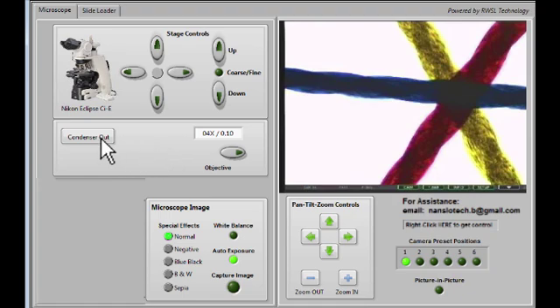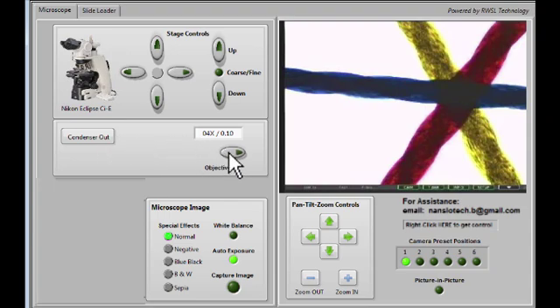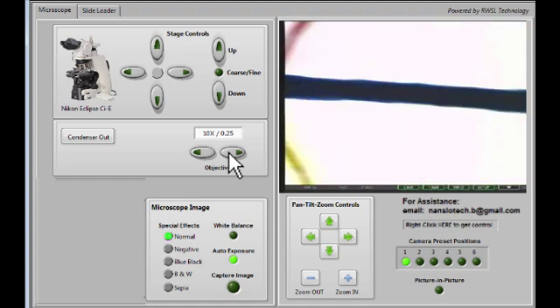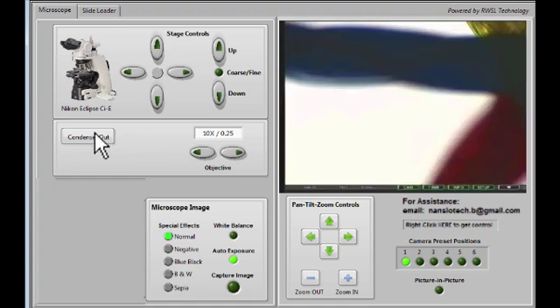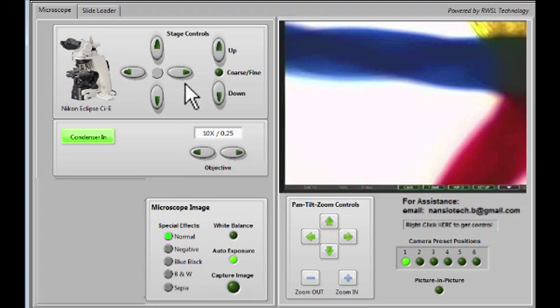The condenser can be controlled with this button here. For the 4x objective, you want the condenser out, as it is. But for 10x and higher, it's best to have the condenser in. This just sharpens the image and gives better contrast and better color.